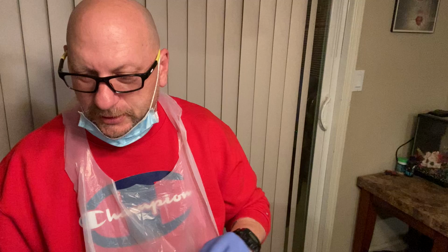Today is 5/2021. This is Microbiology 225, and we are isolating individual colonies today in this lab experiment. Again, this is week 2, exercise 2. Everything's been sterilized. I got my cultures here, my alcohol, my bleach, my candle.